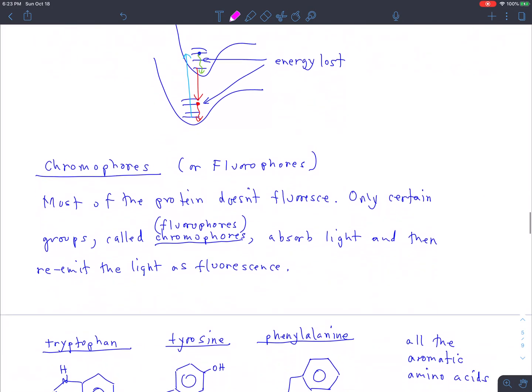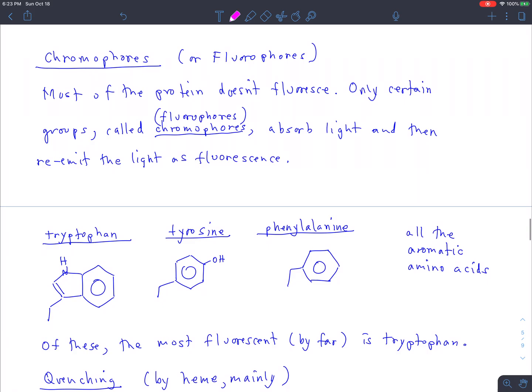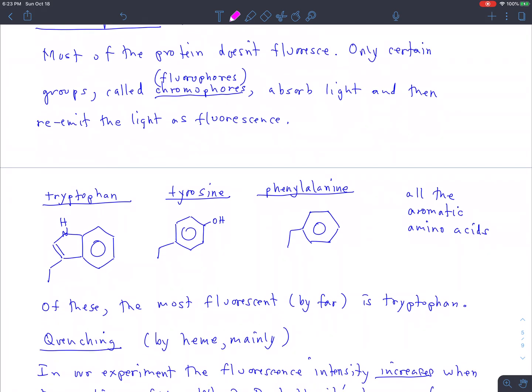But what good does that do us? Well, before we go to what good it does us, what is it that's actually fluorescing in the protein? Well, there's a bunch of fluorescent residues naturally occurring in the protein. They all have a quantum yield, right? The quantum yield is how many fluorescent photons you get out per incident absorbed photon. And a lot of fluorophores have really bad quantum yields. This one has a really bad quantum yield. That one has a really bad quantum yield. This one doesn't have such a great quantum yield.